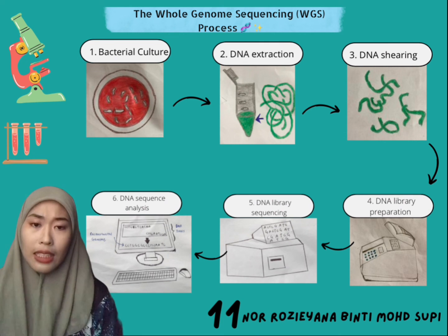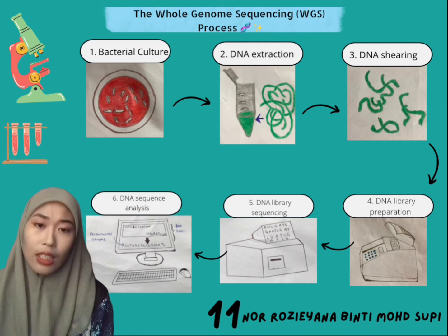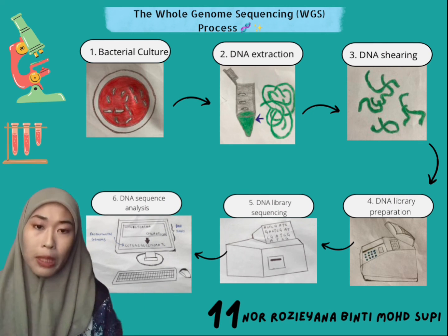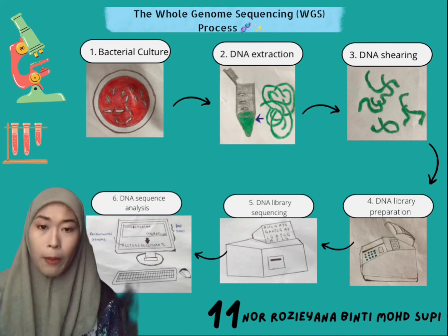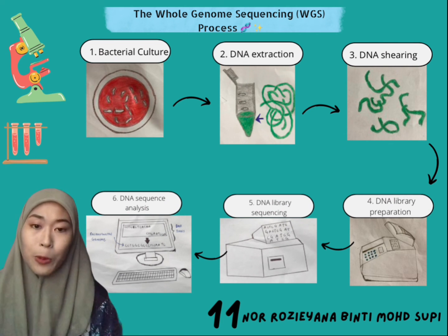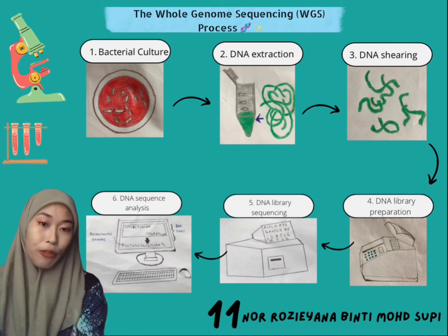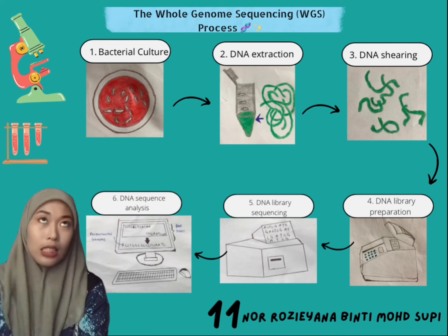The sequencer generates millions of DNA reads, which are assembled in the correct order using specialized computer programs, much like a jigsaw puzzle. The genome sequence will contain millions of nucleotides in one of a few large parts. It is ready for further study once it is complete.